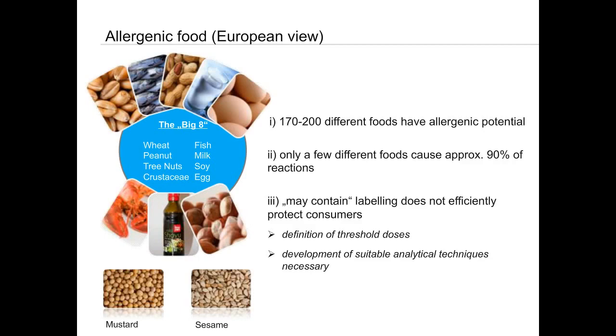If you have a look at the allergens, it is in general the case that you will see families of food allergens, the 11S legumins, for instance, as seed storage proteins, which you do see in hazelnuts, in pecan, and in walnut as well. And they do have really incredible high sequence identity, something around 95%. So what we want to do is to distinguish the 11S from pecan, from walnut, and from hazelnut. And this is one thing where ELISA, for instance, from time to time fails because of this incredible high sequence identity. And this was one of the further criteria we wanted to address.